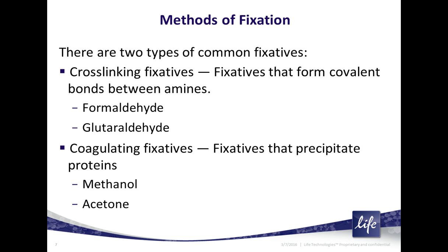Formaldehyde cross-links the amine groups on proteins, namely the lysine residues, and that cross-linking between proteins helps retain structure, and thus the morphology of your cells and tissues is better retained. Glutaraldehyde fixes more strongly. It has twice the reactivity.